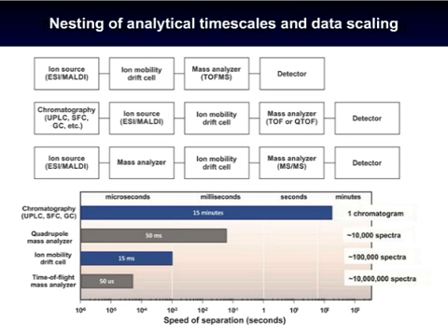So what I'm showing here is sort of recasting the timescales that George Stafford showed in the first talk. And what I would like to do is to highlight the bottom portion. It shows the order of magnitude differences in the timescales involved. So in chromatography, we're oftentimes dealing with minutes or hours. Then if you're using things like quadrupole analyzers, you're often dealing with milliseconds, as well as ion mobility. But what we oftentimes see is the combination of time of flight, which allows microsecond separations.